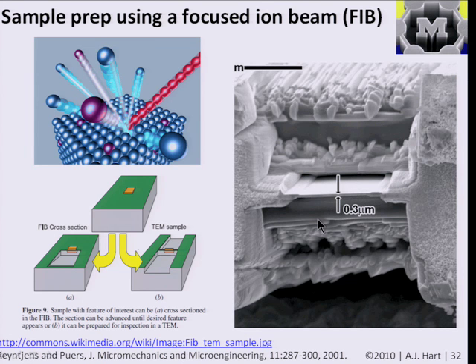So I guess in this case, the researchers wanted to look at the characteristics of this thin film and, for example, see its grain size and grain structure, and you wouldn't be able to see it in an SEM because it's buried, and also the resolution will be limited. So quite a painstaking process, but it can certainly work, and that's the type of thing that you would do to thin out an existing sample.